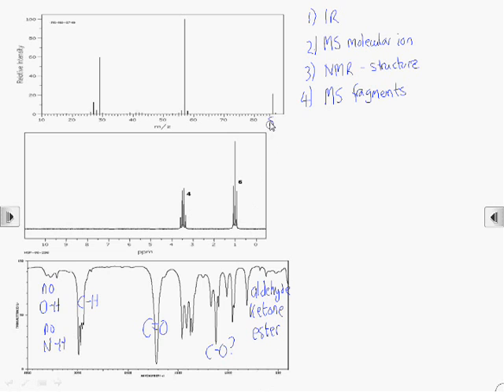If we look now at the mass spec, we can see the molecular ion peak is at 86, so the relative formula mass of our molecule is 86.